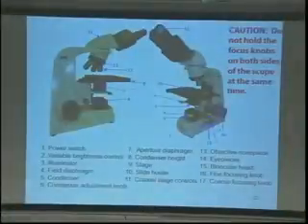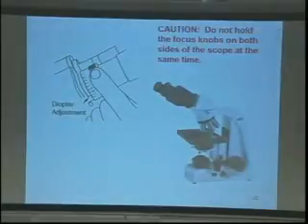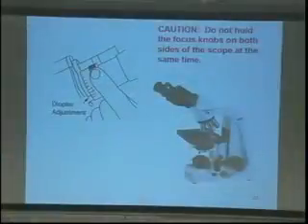So anyway, various parts of this, you'll go through that in lab. What you want to do is use two eyes. These are called binocular microscopes. Not easy to do. This is actually, I think, the hardest thing for students to do. What you want to do is close one eye, usually the left, get the specimen in nice clear focus with your right, then close your right eye, and it may not be in focus anymore. So what you can do is slightly adjust the focus of this ocular, it's called a diopter adjustment, to compensate for the fact that your left eye and right eye may not have the same focal ability, okay?